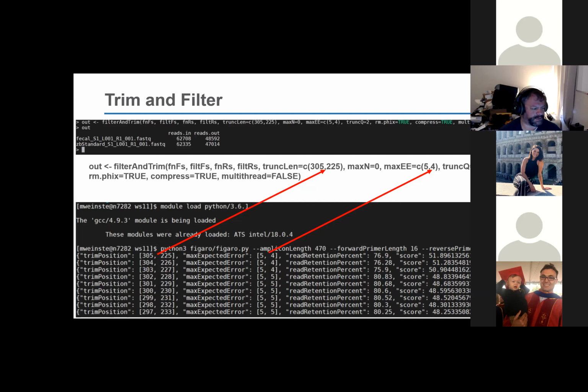Okay, so it looks about right to me. Did Figaro run correctly? I'm sorry, what do you mean? Say that again? When you ran Figaro to examine the files, when did we? So that was the one that generated the output that looks like this thing at the bottom of the slide. Oh yeah, that ran correctly.